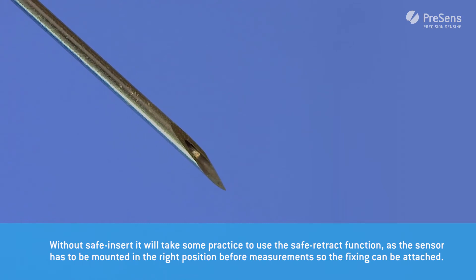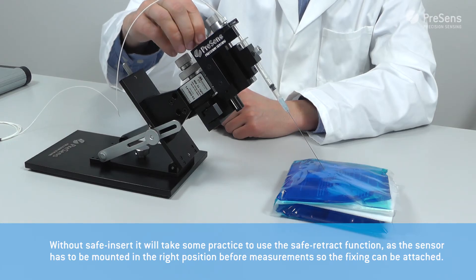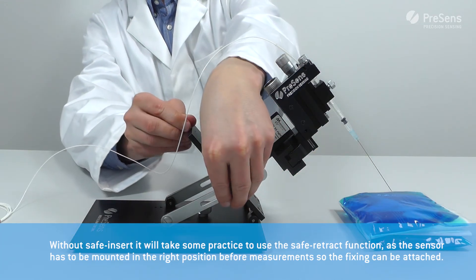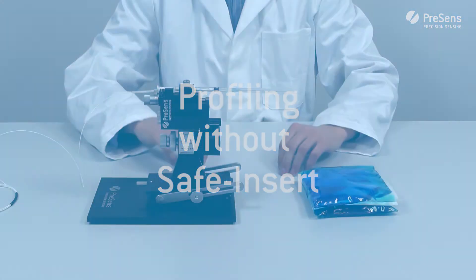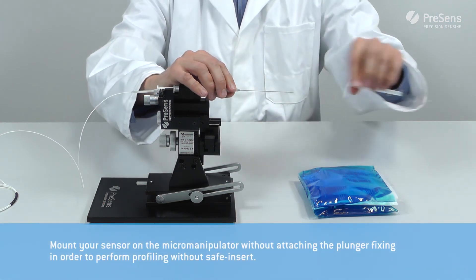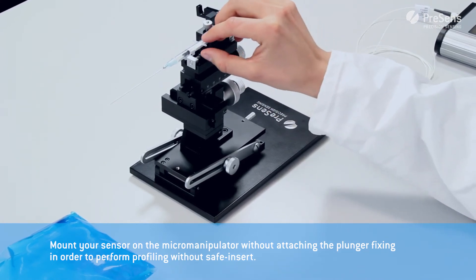Without safe insert it will take some practice to use the safe retract function, as the micro sensor has to be mounted in the right position before measurements so the fixing can be reattached afterwards. Mount your sensor on the micromanipulator without attaching the plunger fixing in order to perform profiling without safe insert.